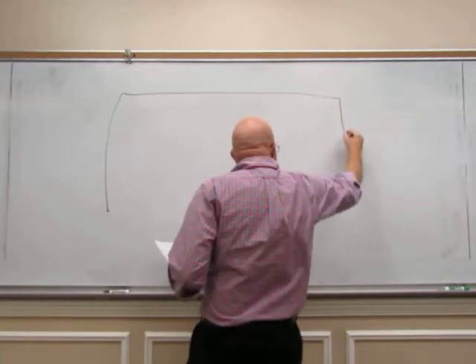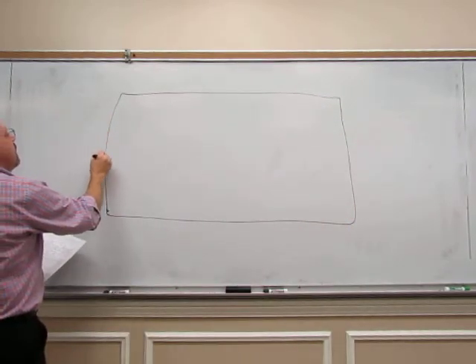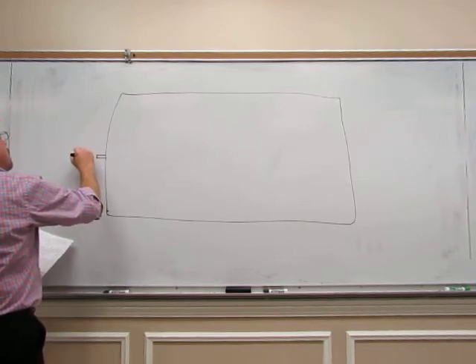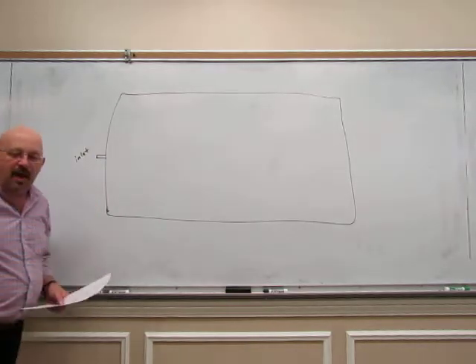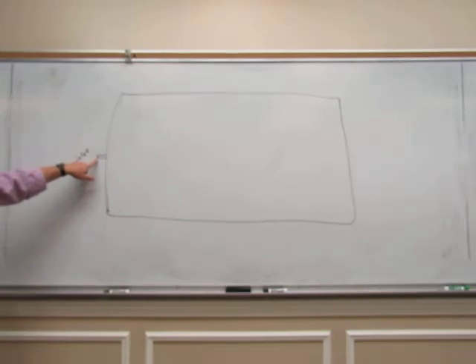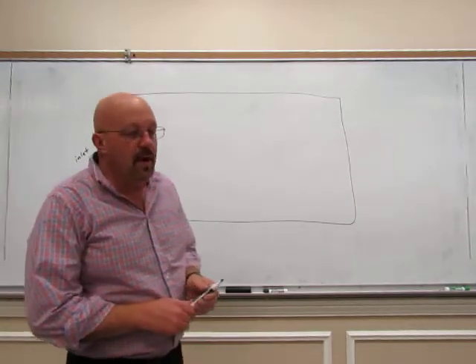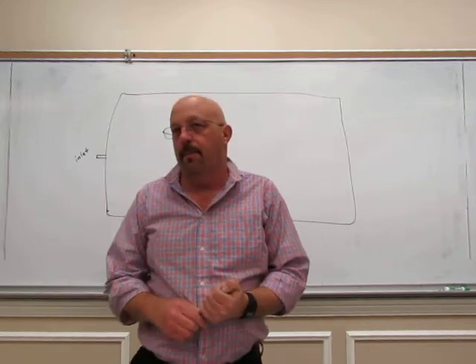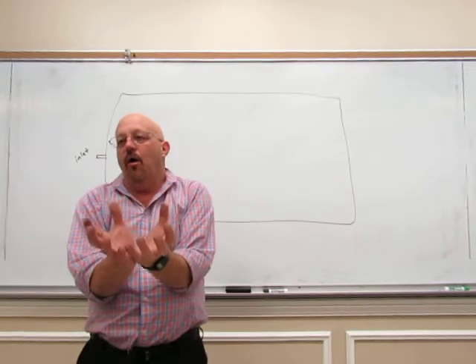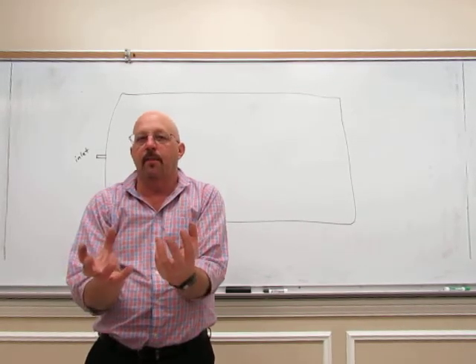A big box represents the instrument. And we will have an inlet where we put our sample. Now the inlet will have a septum on the end of it here. The entire instrument is hooked up to an ultra-high vacuum. It's completely sealed and it's hooked to an ultra-high vacuum pump that pulls that vacuum on it.